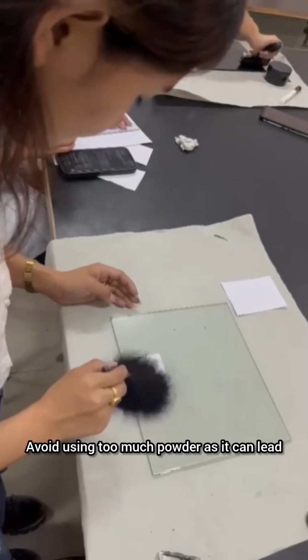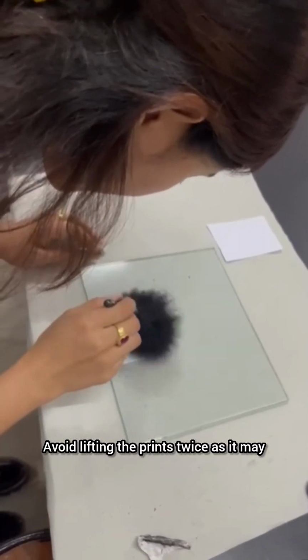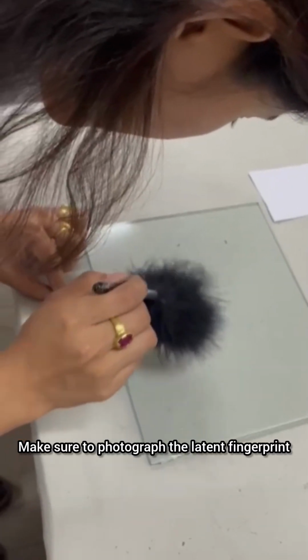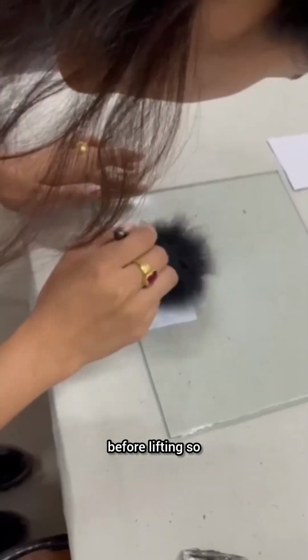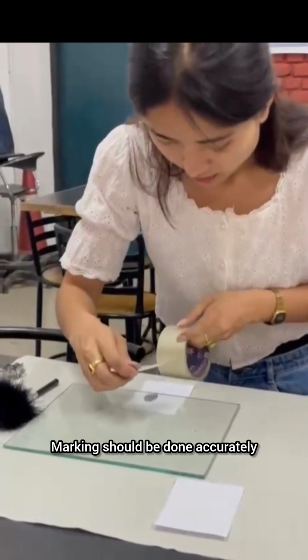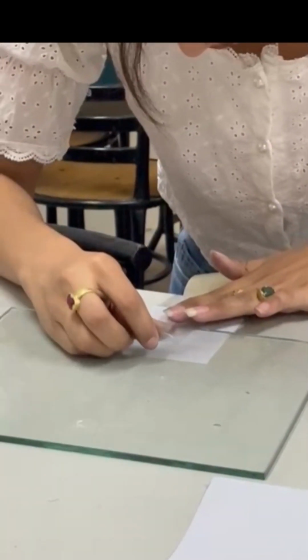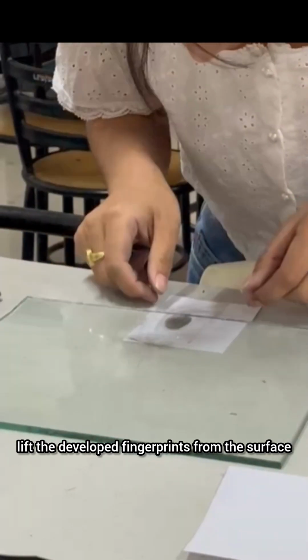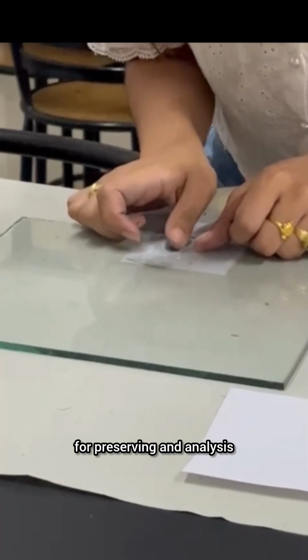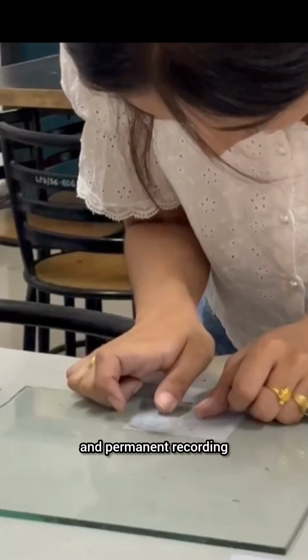Avoid using too much powder as it can lead to improper results. Avoid lifting the prints twice as it may also lead to breaking of the ridges being developed. Make sure to photograph the latent fingerprint before lifting so that it can be used to compare with the lifted print. Marking should be done accurately. I can then use lifting tape to carefully lift the developed fingerprints from the surface and place it onto a fingerprint backing card for preserving and analysis. Lifting is done for comparison purposes and permanent recording.